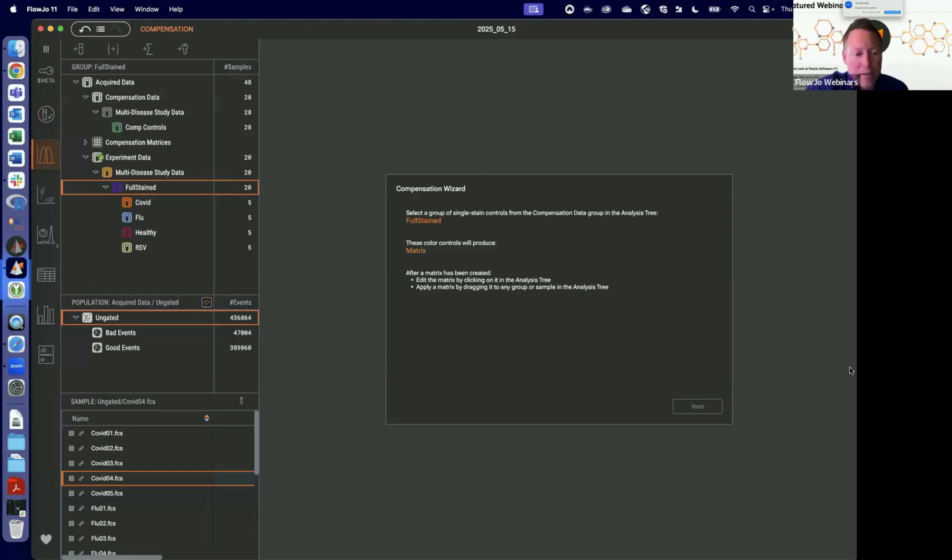And then it's up to you how detailed to be, because the general idea of reporting is that someone can reproduce your work. If you give those ideas, that'll be enough to reproduce your work. And if you want to give performance metrics, you can. We have stats throughout the program that you could report: the percent good events, the number of good events, et cetera. There's a question on what if QC fails?